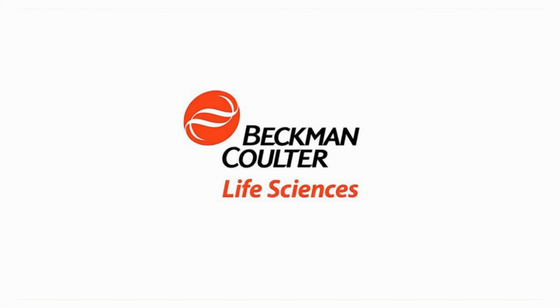It's a topic that's come up from time to time, and I would say we're a service part of the organization. So if our biologists and scientists find the need for that, and we have projects that need to go down that route, then we'll find a way to help with automation. Like I mentioned earlier, we could automate different aspects of it. It could be an A to Z process, or we could automate different components that would fit these different types of workflows, and try to just relieve bottlenecks in that manner. So I would say we don't have cell-free expression platforms automated at this point in time, but that's something that could be changing.